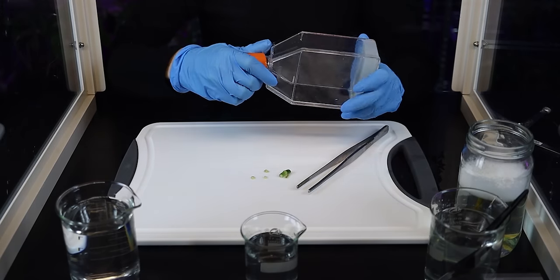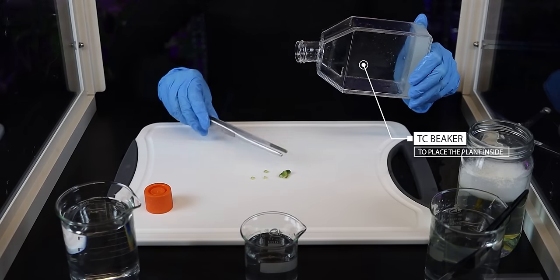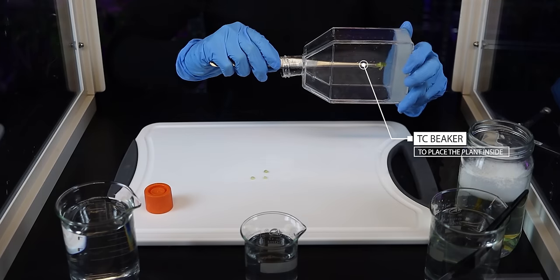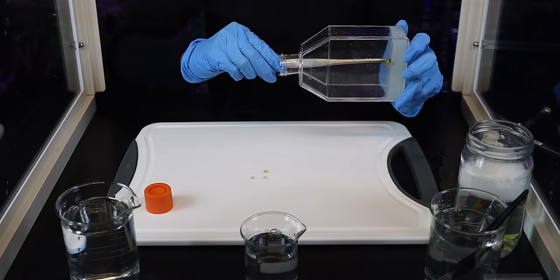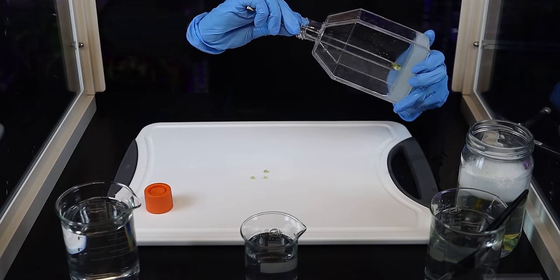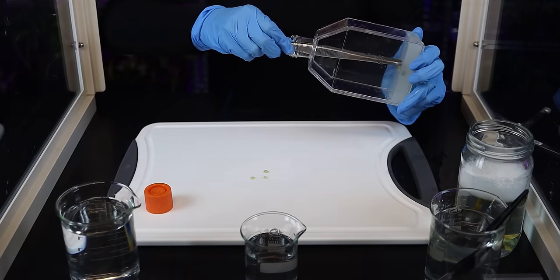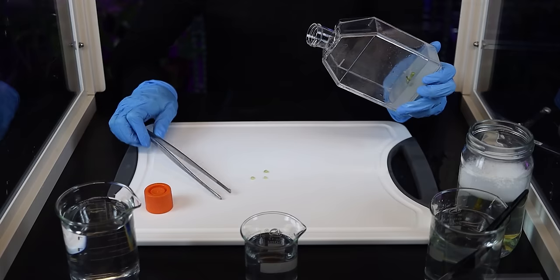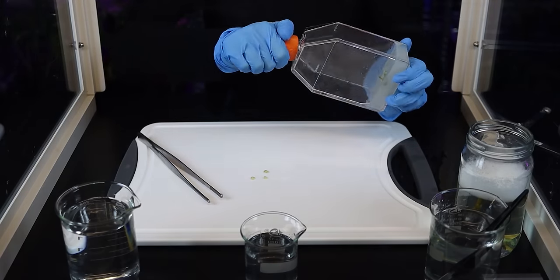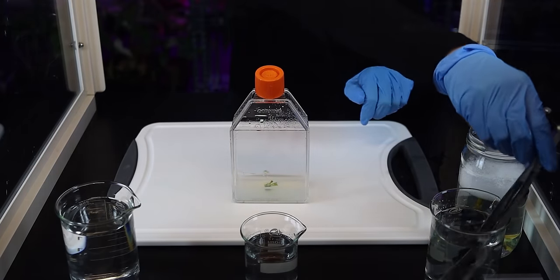I'm opening my growing container on its side to further reduce any chance of contamination and I'm placing the plant material into the agar. Now, honestly, this can be a little bit tricky, especially for me in this demo as my tweezers just aren't quite long enough to use on these containers. So, as you can see, it's a little bit fiddly, but I do get it in the end. Now that the plant material is inside the agar, I'm shutting the lid nice and tight. And there you have it! There is your prepped tissue culture plant.